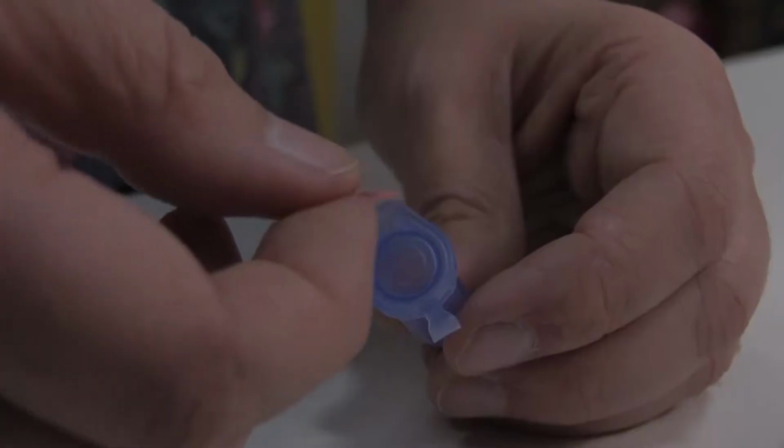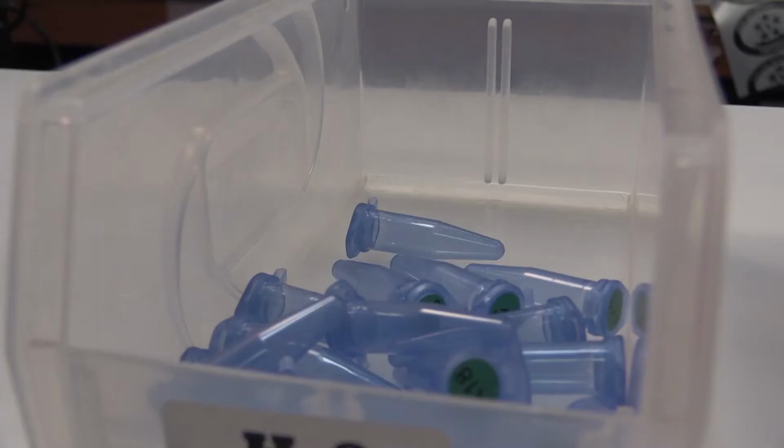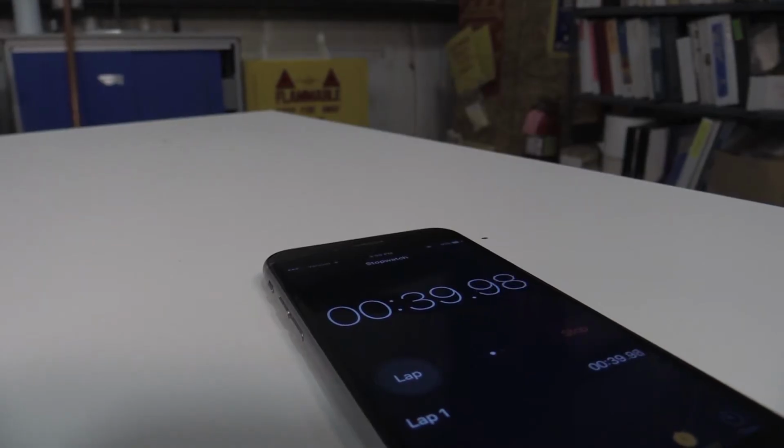We don't make decisions on assumptions, and we don't expect you to either. So we're here to determine whether using color-coded labels really improves quick recognition and can boost efficiency in your laboratory.